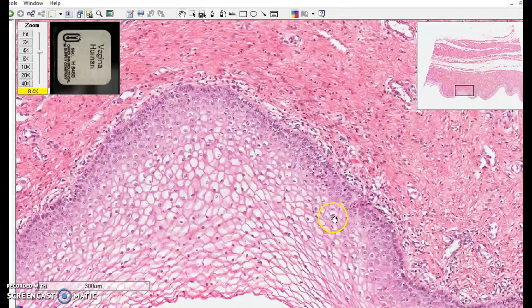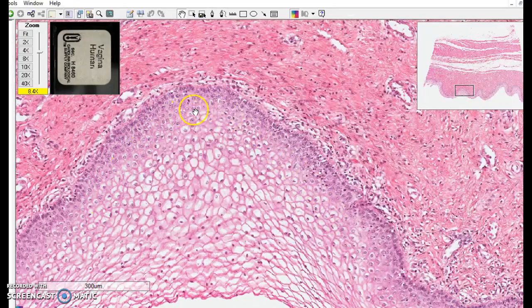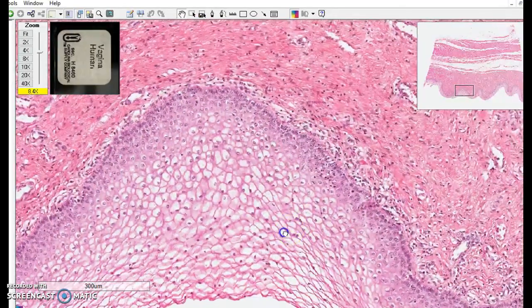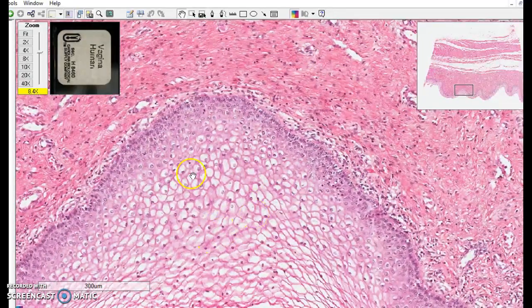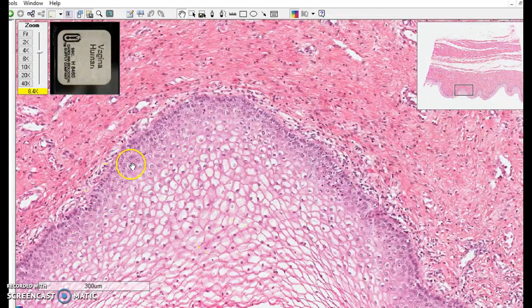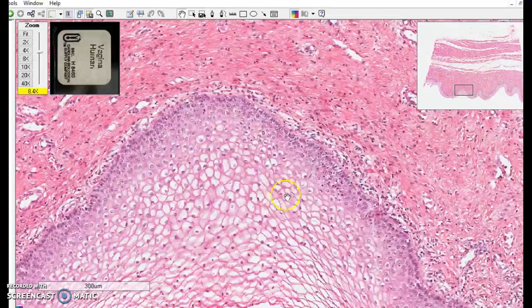The cells are very close together in a sheet. There are no blood vessels visible through here. You can look around, there are no blood vessels. There are over here but not in this tissue. There's very little matrix, and in fact you might say there's no matrix.